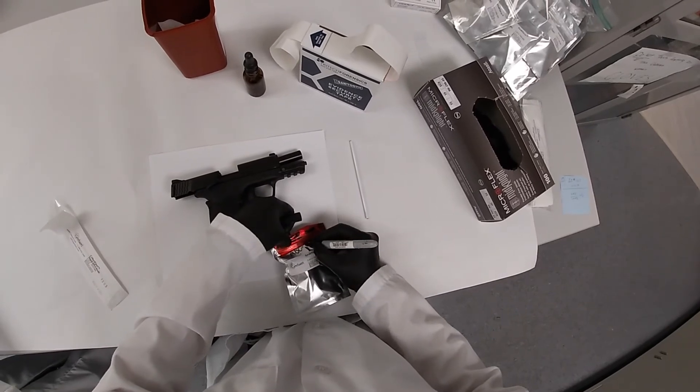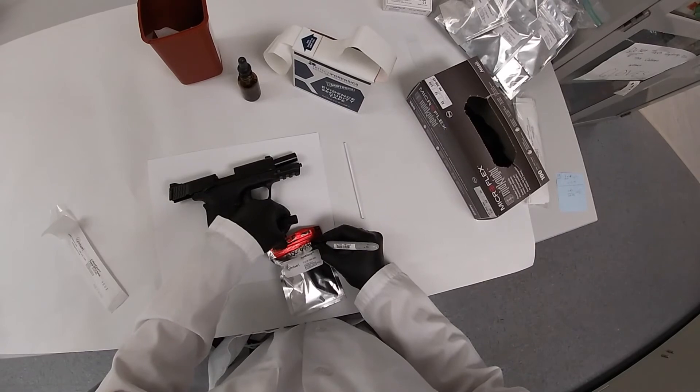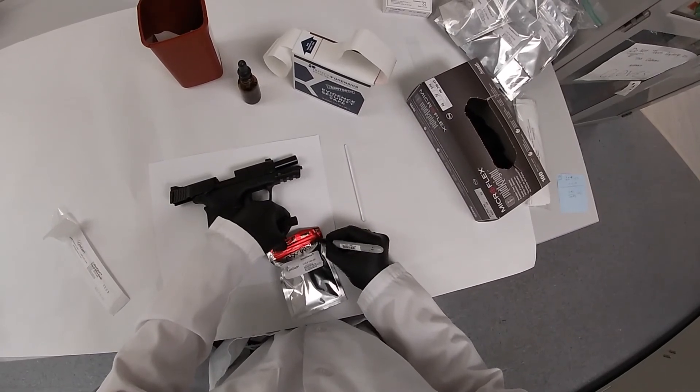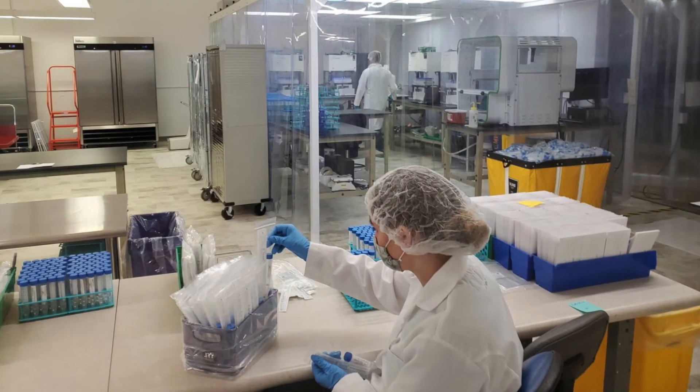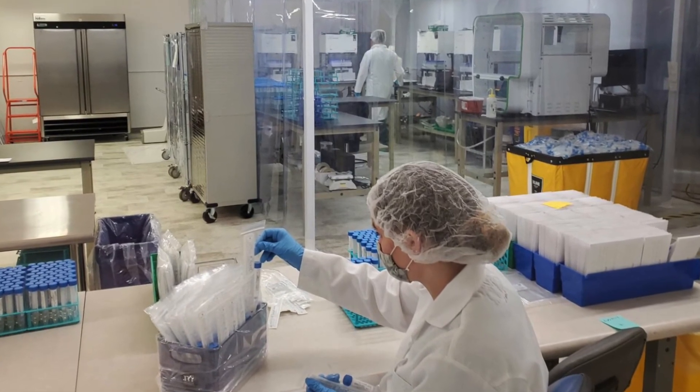Your sample is now ready for transport and downstream processing. At Gentury, we are committed to working with forensic scientists to simplify the collection and improve the quality and efficiency of downstream processing.